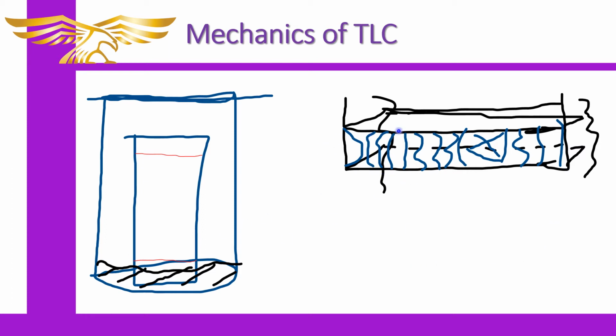If we put this down into the solute and we have spotted it, as we would say with TLC plates, with the substance we want to carry through for separation, then the length at which that substance moves along the plate in the vertical direction inside the development chamber will be correlated to the series of reactions that occurs between the binding to, or the favorability of sticking into the material of the plate itself, the interactions that occur between the silica and the molecule, or the solvent and the molecule, and whether or not the solvent shields the molecule from interactions with the plate.